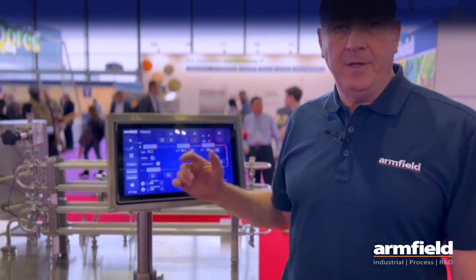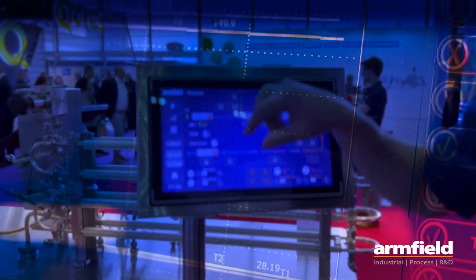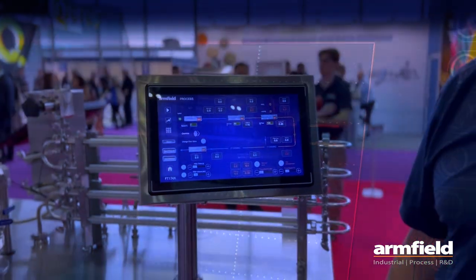The complete system is run and controlled by this 15-inch high-resolution touch screen. On here you have all your process parameters and you can input your set points, data log information in real time based on what the plant is giving you, and store a number of preset recipes for your most common products. The system is capable of SIP, should you have it linked to a filler, and CIP — everything is run and controlled by this one touch screen, so one person can operate the complete system at any one time.